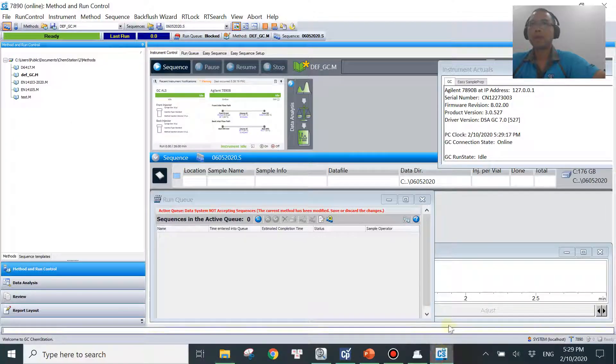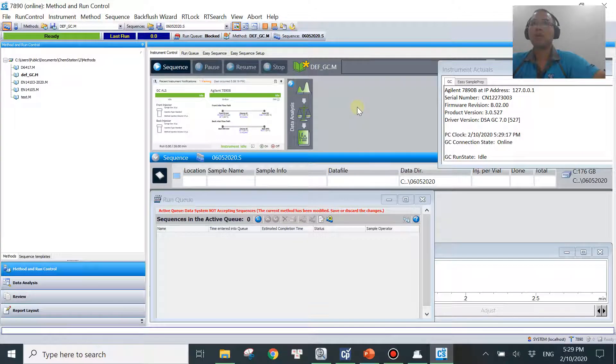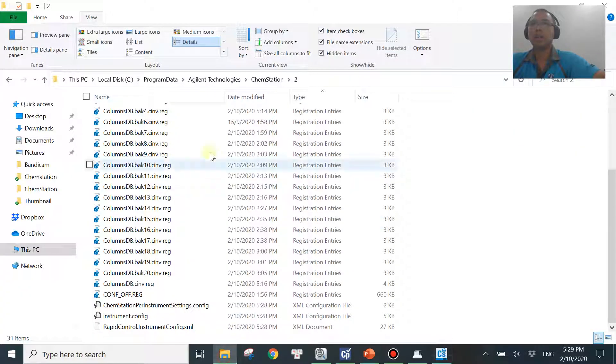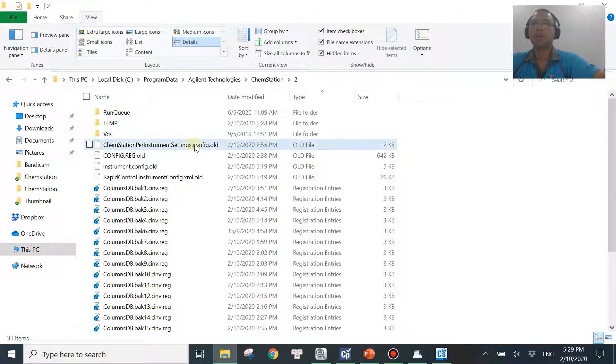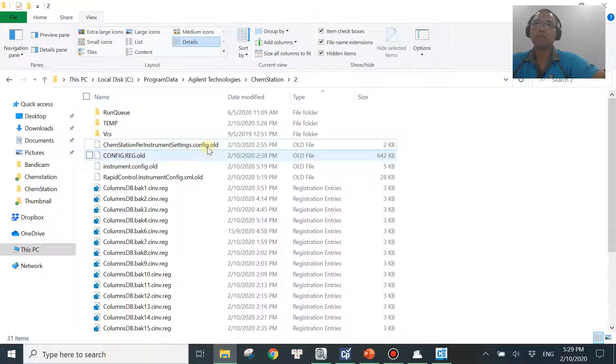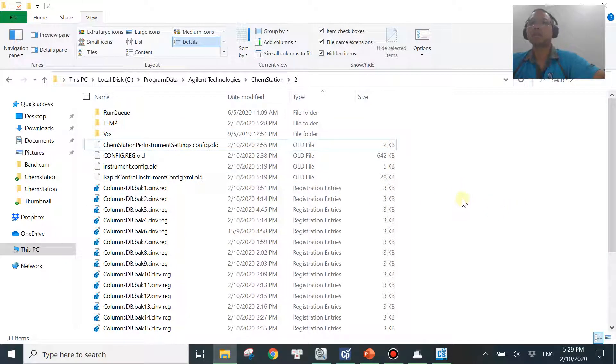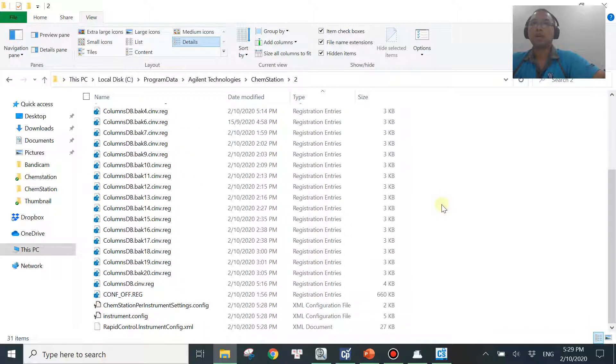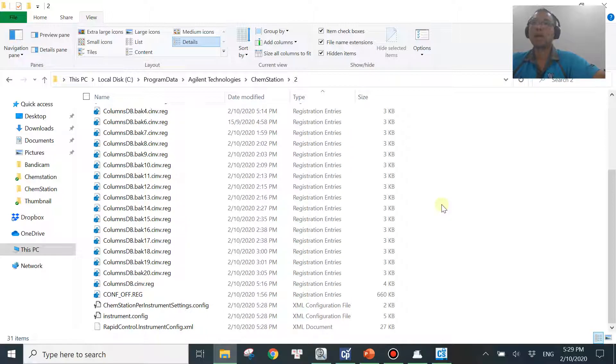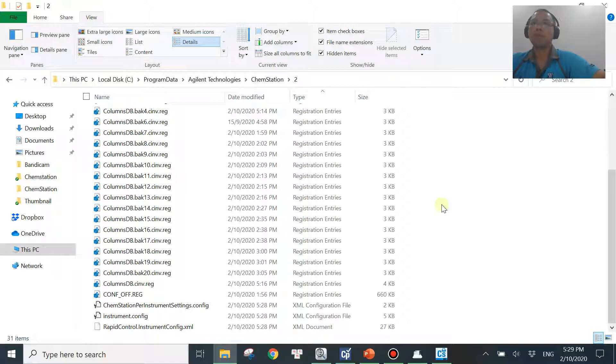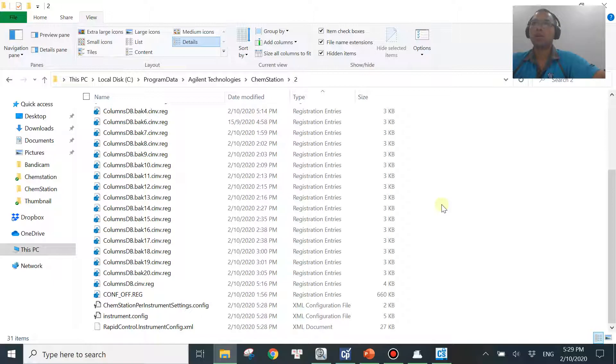So once you're happy with all of this, you can just delete all of these old files, or if you keep them over here, it doesn't matter. That's okay. So that's the way how we fix the problem of the auto-start macro file, the error message I showed you from the beginning of the video. And that will work every single time. I've been doing this many, many times for my customers and it should work for you as well.